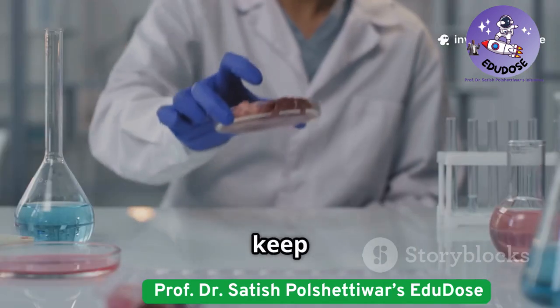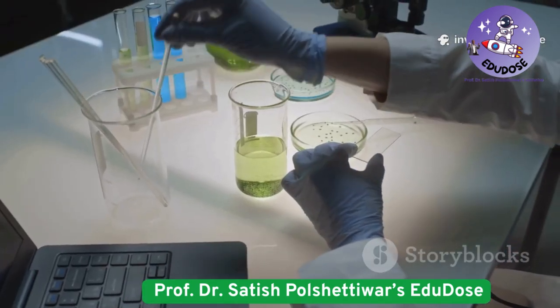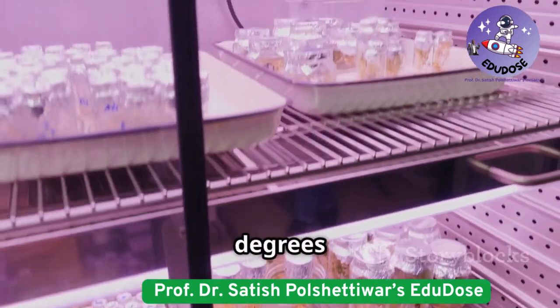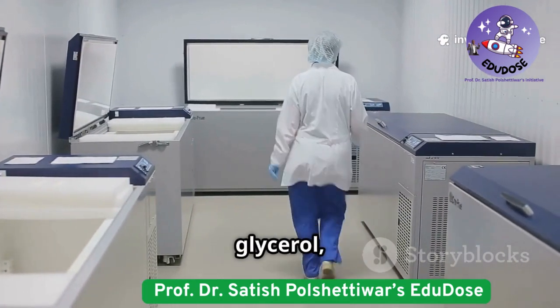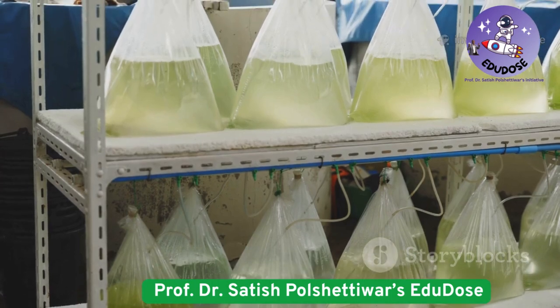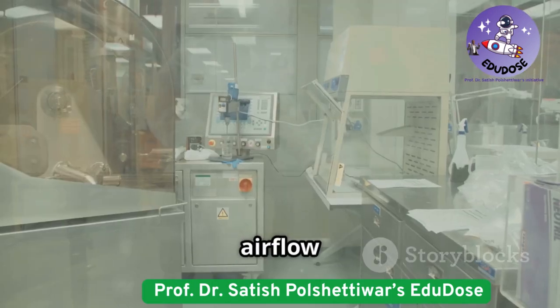So, how do we keep these cultures happy and uncontaminated? Maintenance is key. Periodic subculturing onto fresh media, refrigeration at 2-8 degrees Celsius for short-term storage, deep freezing at -70 degrees or below with cryoprotectants like glycerol, and even lyophilization or freeze-drying for long-term storage. You'll need slants, screw-capped tubes, cryovials, and a good laminar airflow hood.